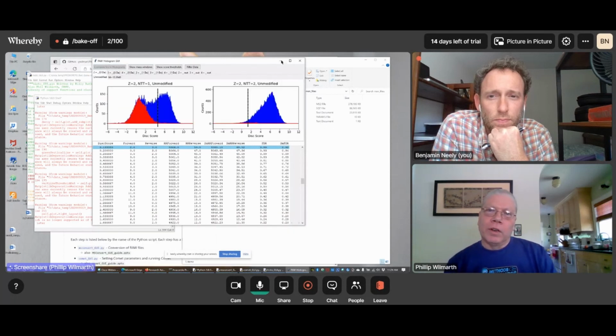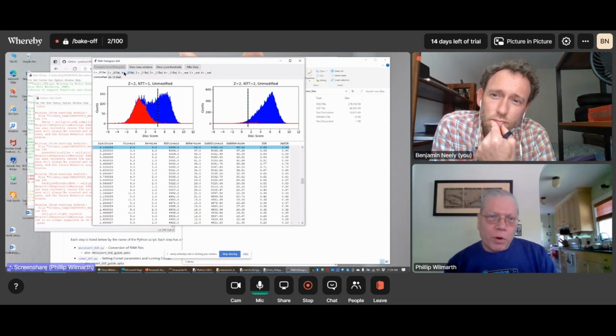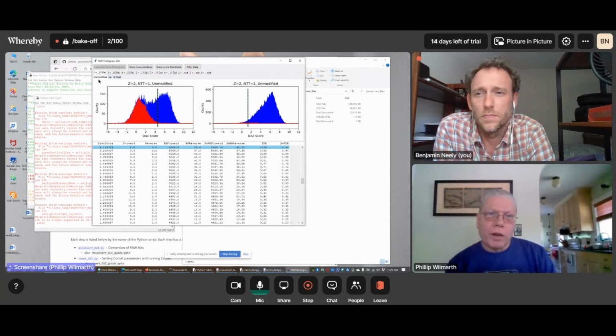Okay, so now we show up with our histograms, and we see that we've got 2+, 3+, and 4+ for the 0 Dalton peak, and the same thing, 3 charge states for the 1 Dalton peak, and 3 charge states when we're not inside either window. We've got unmodified peptides and modified peptides. Sometimes the modified peptides have a very different search space size, like phosphorylation is a very large search space size compared to the unmodified peptides.